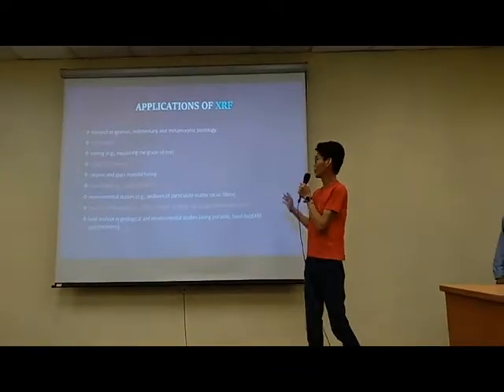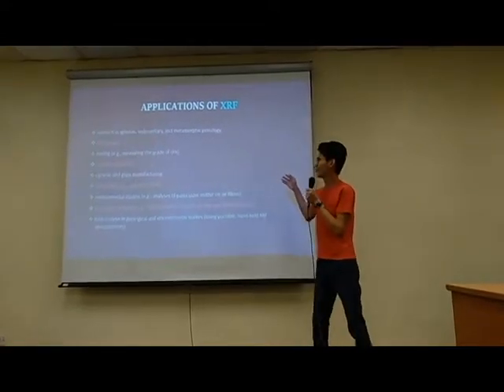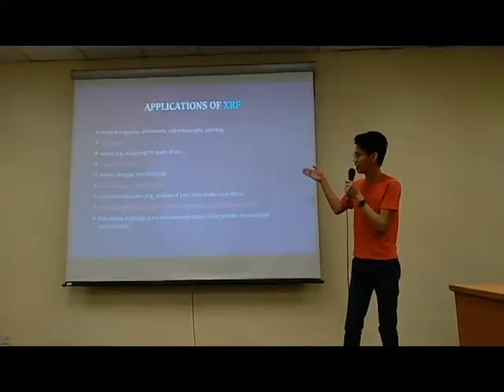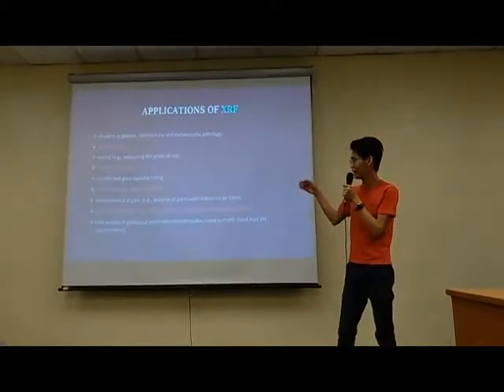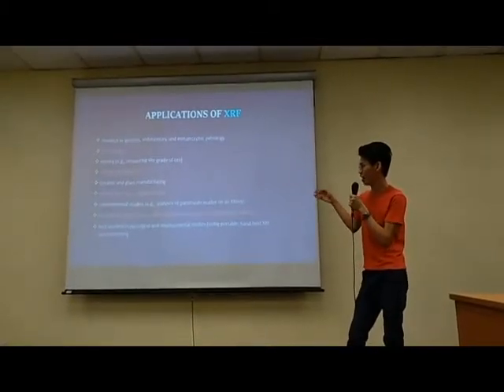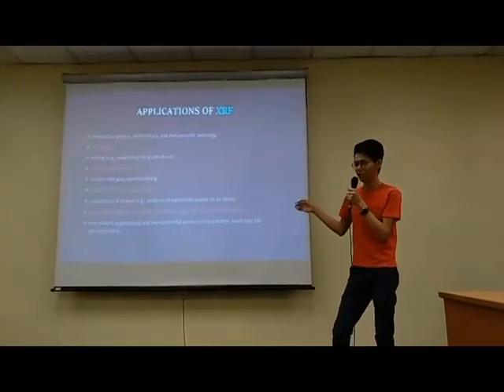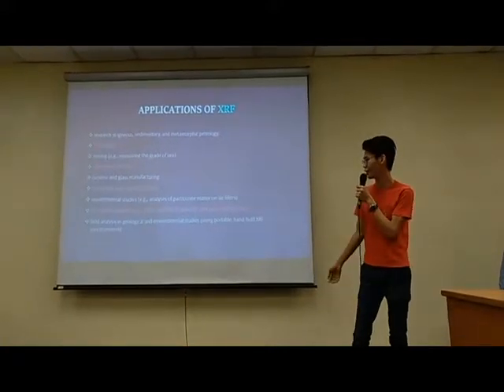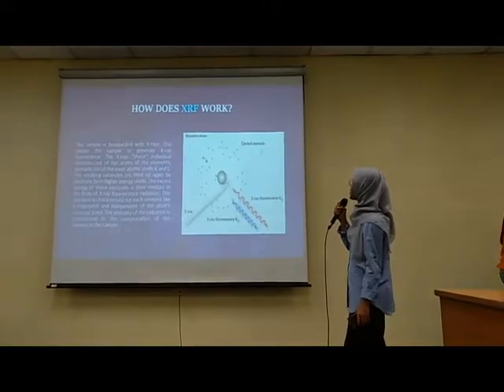Now, for the applications of XRF, it is usually used in research in igneous, sedimentary, and metamorphic petrology, soil survey, mining, cement production, ceramic and glass manufacturing, metallurgy, environmental studies, and the petroleum industry, and also field analysis in geological and environmental studies. That's all. Okay, I am going to explain how XRF works.